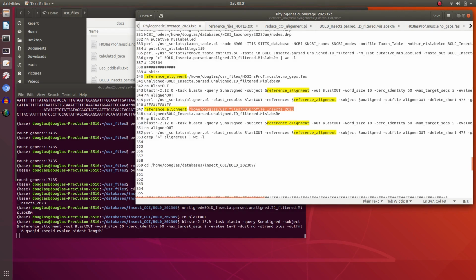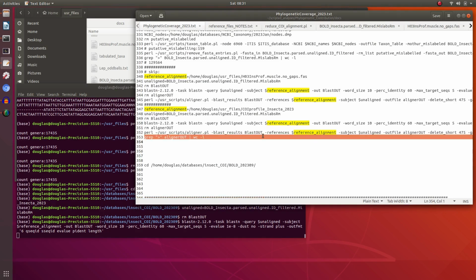We're going to do a new BLAST to get the top hit, and then the aligner to do the pairwise of each. So this should find a reference to align against which is a lot more similar to each query. Hopefully this should be a bit more comprehensive, and then we'll just compare how much we get in the output file. Okay, so this job is started, and I'll just wait for it to run.